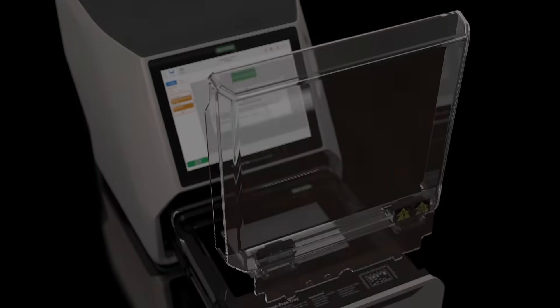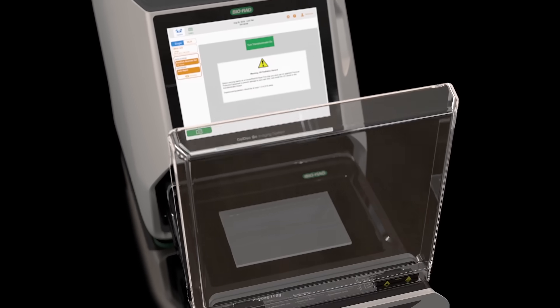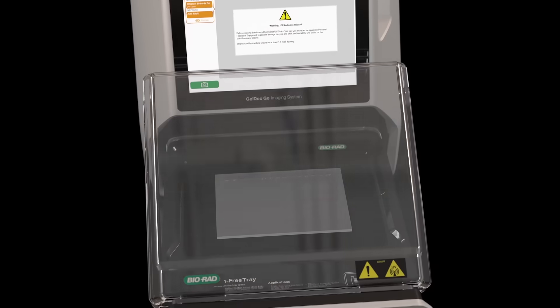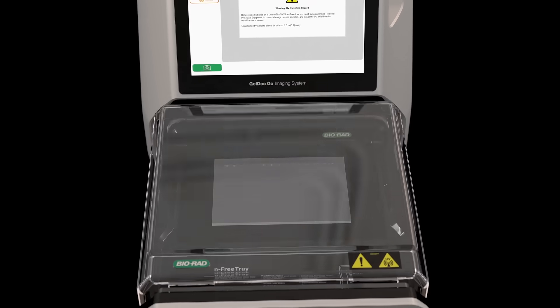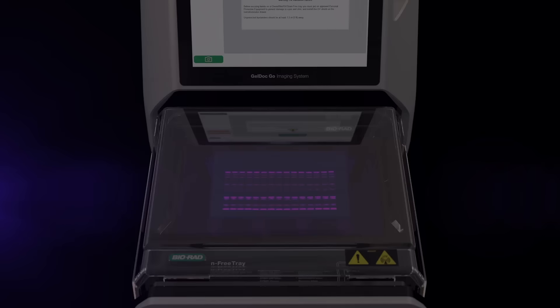Perform nucleic acid gel imaging and band excision with traditional UV stains or using safe stains with the optional blue tray.